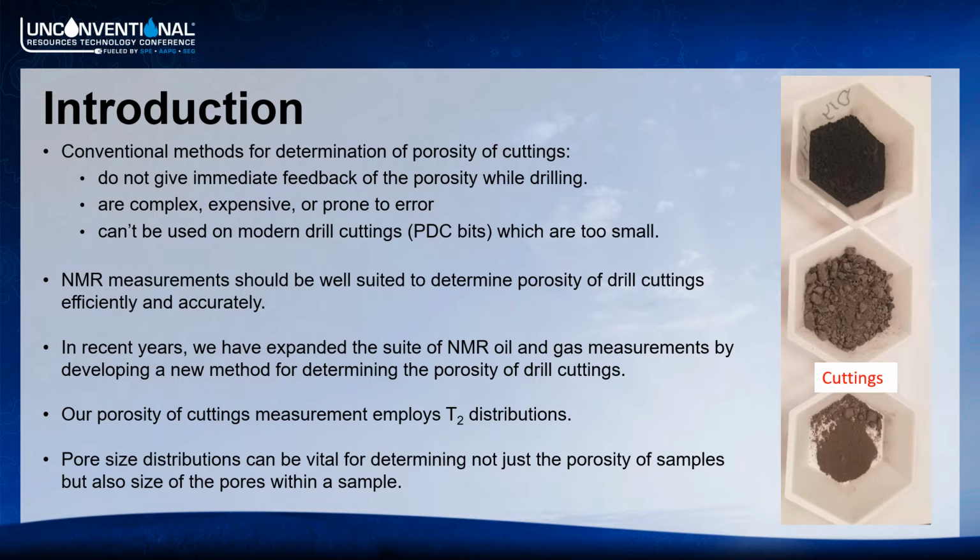Additionally, when doing NMR, we use T2 distribution to determine porosity, and as most of you already know, T2 distribution can be related to pore size distribution, and this gives us some additional information about our samples.